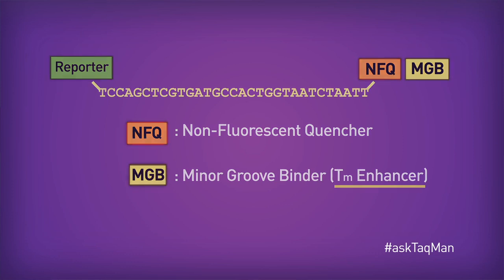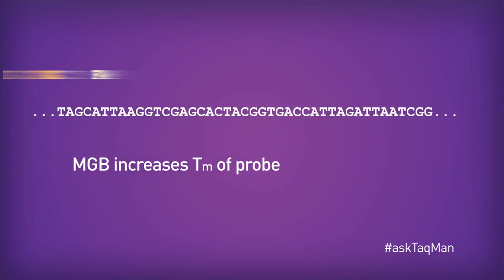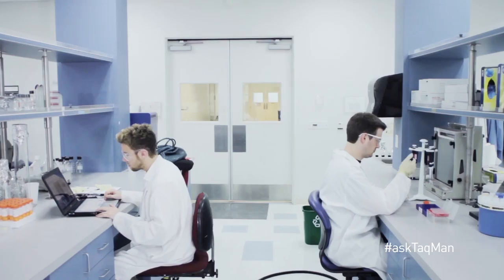more specific probes. You can see that if we redesign our probe as an MGB, it's much shorter than the TAMRA dye quencher probe. In fact, it's less than half the length. The MGB serves as a molecular clamp, holding our probe and template together tighter. And as I say, higher specificity often follows. Now that probably seems counterintuitive, so let me explain.